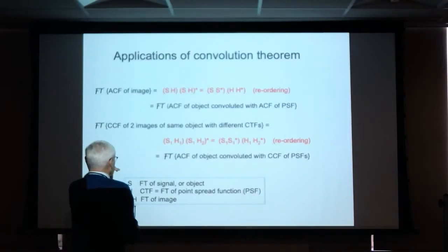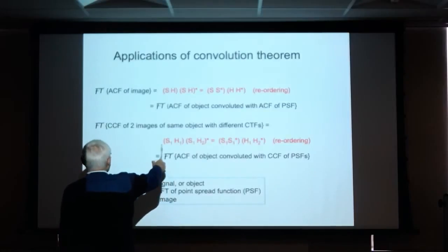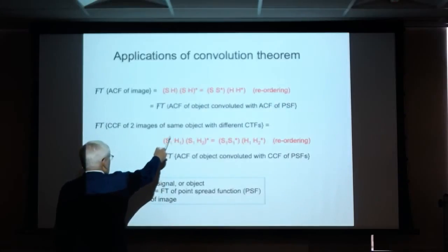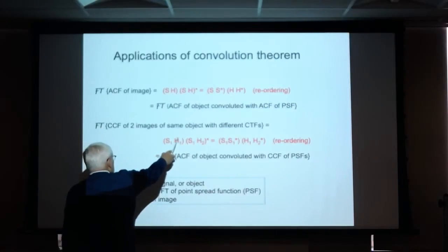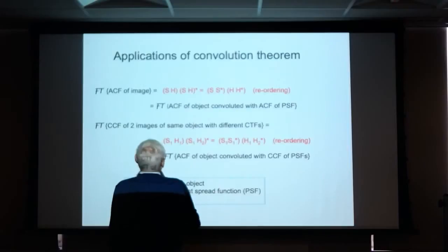And now we apply the various theorems. We apply the convolution theorem in order to say that it's an image, an object, times CTF, and sorry, don't do that here. I think. Okay.